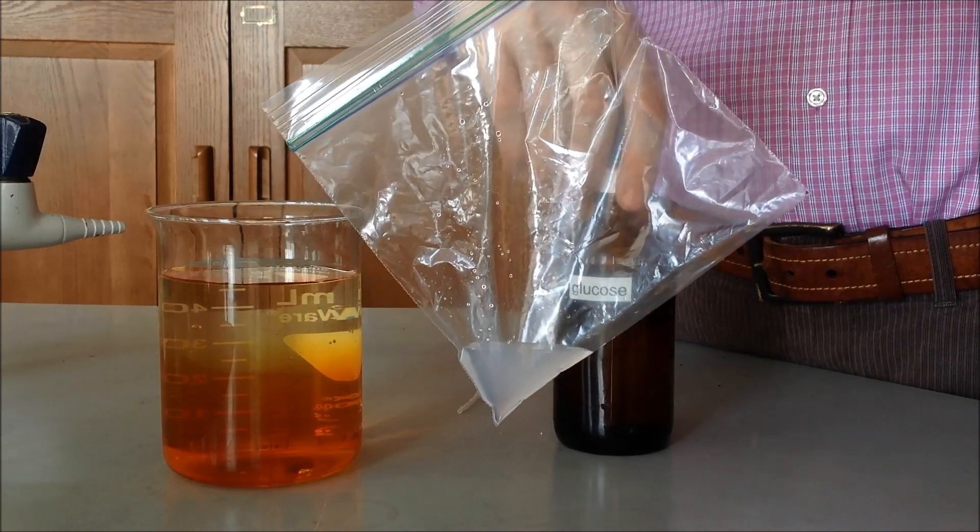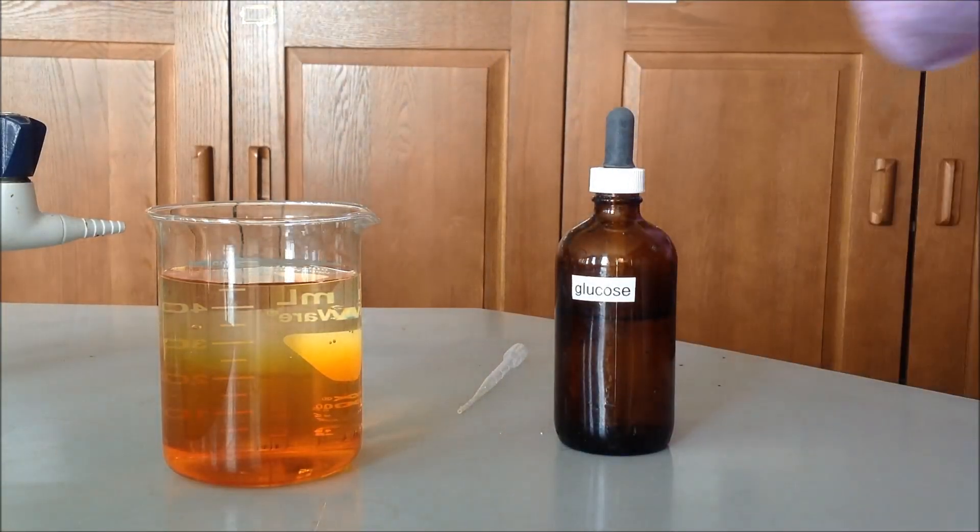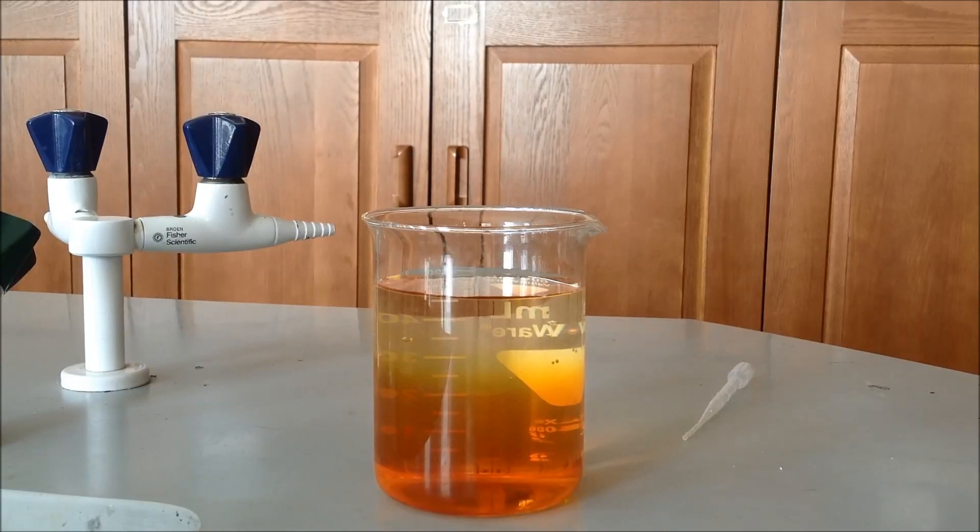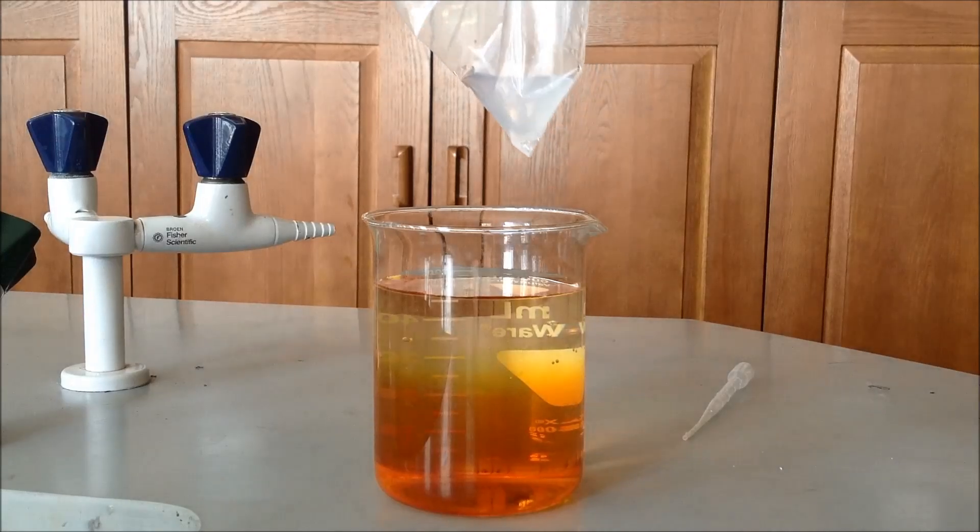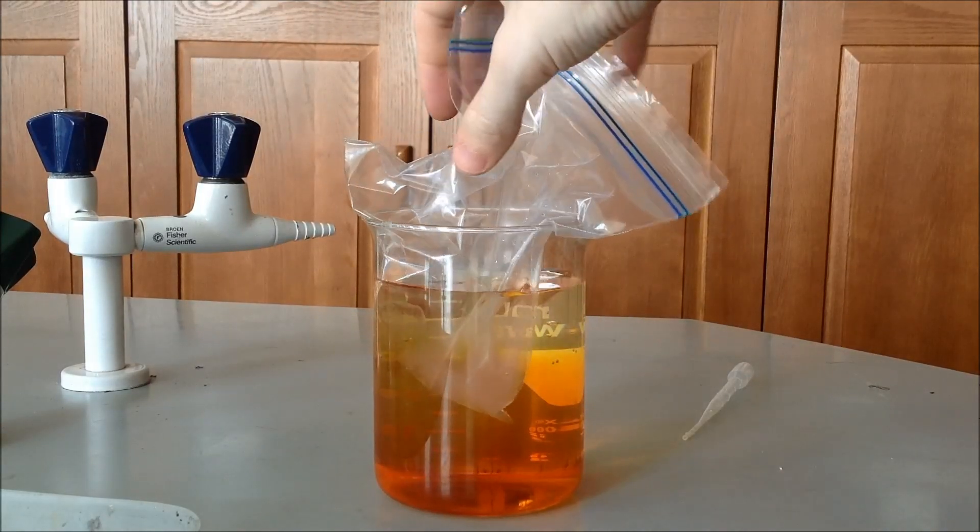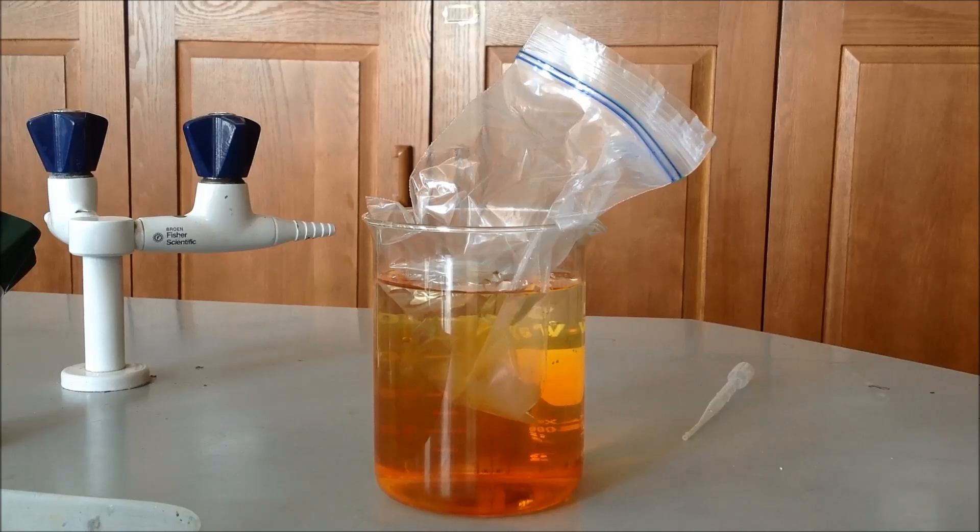Alright, the next step of the procedure is to take the Ziploc bag that has now glucose and starch in it and put it into the beaker with the Lugol's iodine and let it sit for, this one, we actually let it sit for about two hours. And then see what is able to pass through.